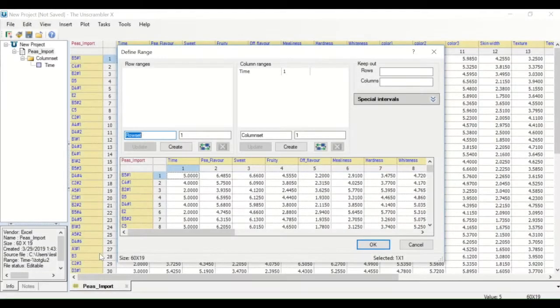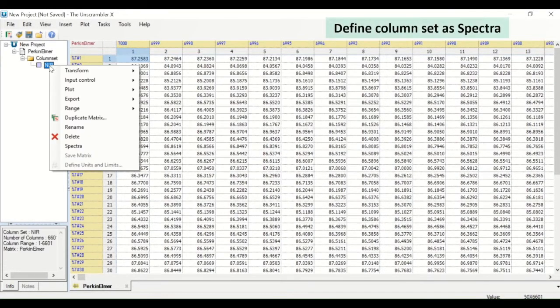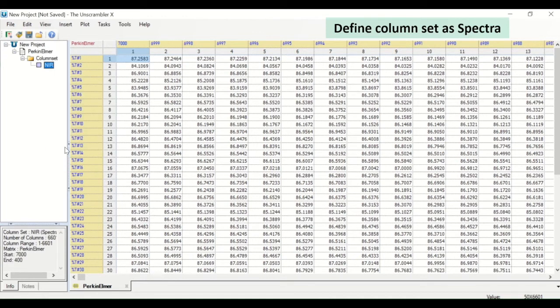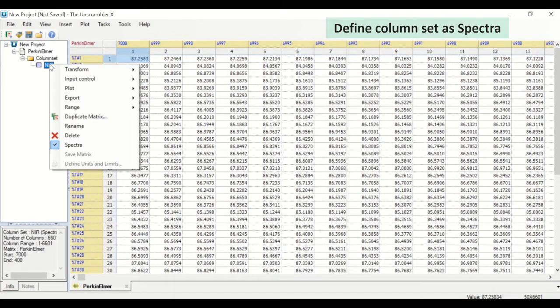A particular column range can be defined as spectra, so that the default plots resulting from analyses are appropriate for spectral data.